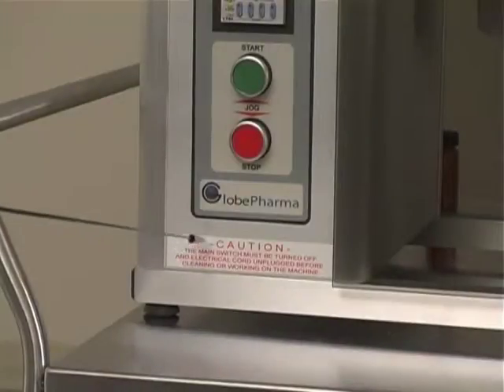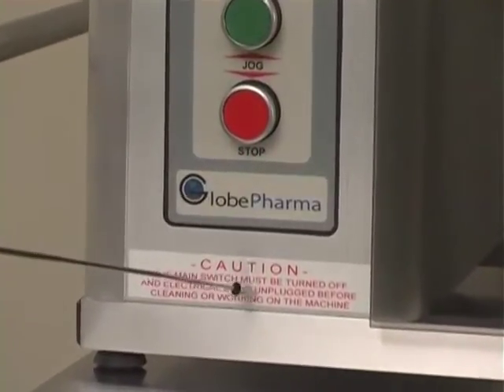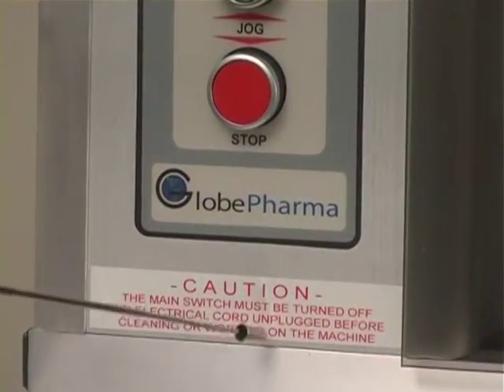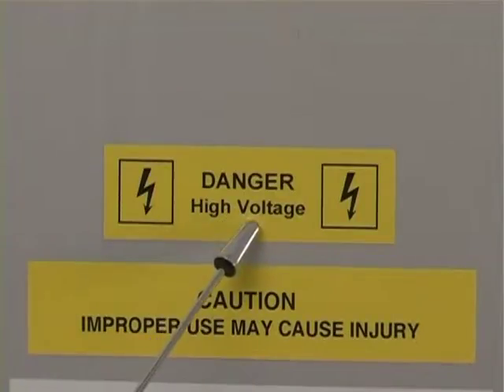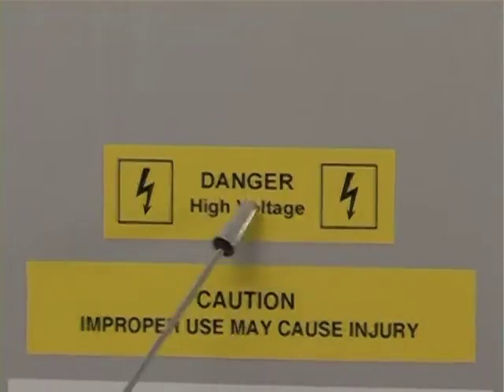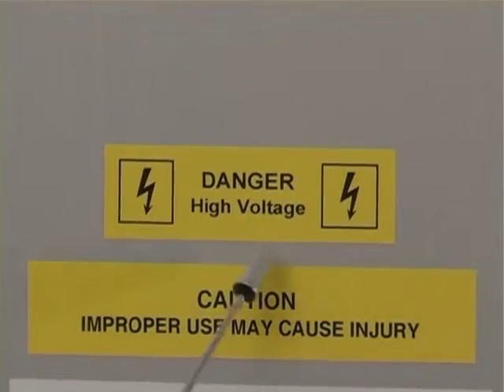The main switch must be turned off and the electrical cord unplugged before cleaning or working on the machine. Although this machine works on 110 volts or 220 volts, you should be careful not to touch any exposed wires or anything like that. You should always be careful with the voltage.